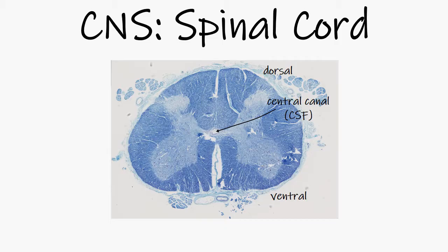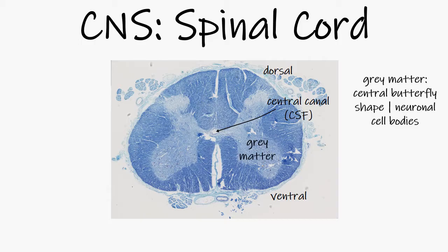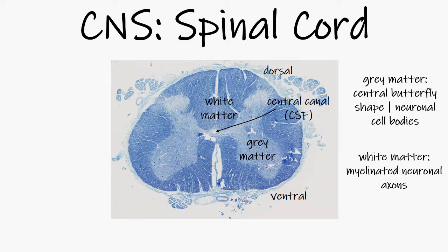Here is a cross-section through a lumbar spinal cord. It is blue because it is stained with Luxol Fast Blue, which you can Google if you are interested in learning more about this special stain. Isn't it beautiful? It is divided into grey matter, which is composed of neuronal cell bodies and forms a central butterfly shape, and white matter, which is composed of myelinated nerve axons.